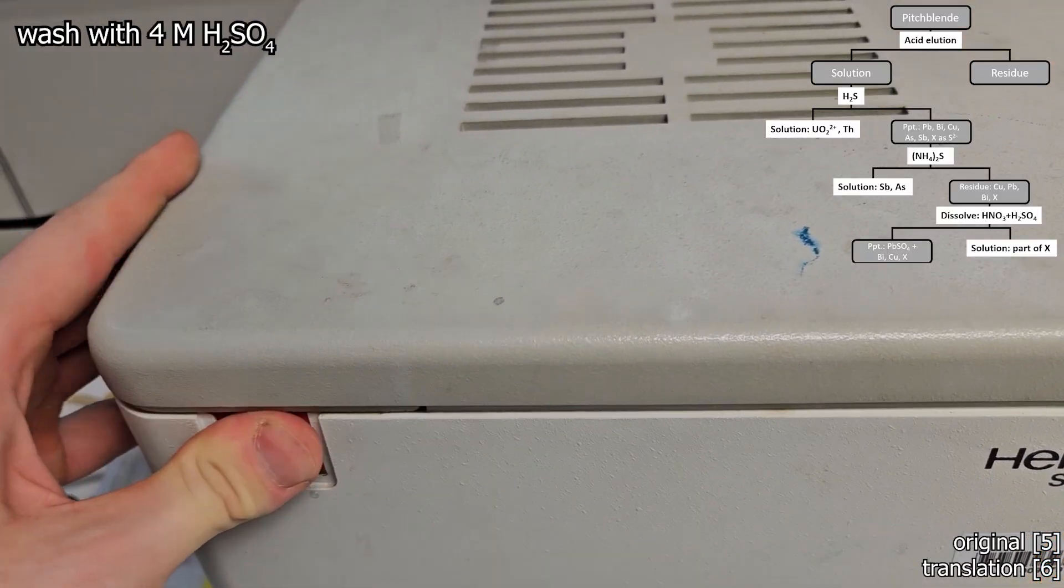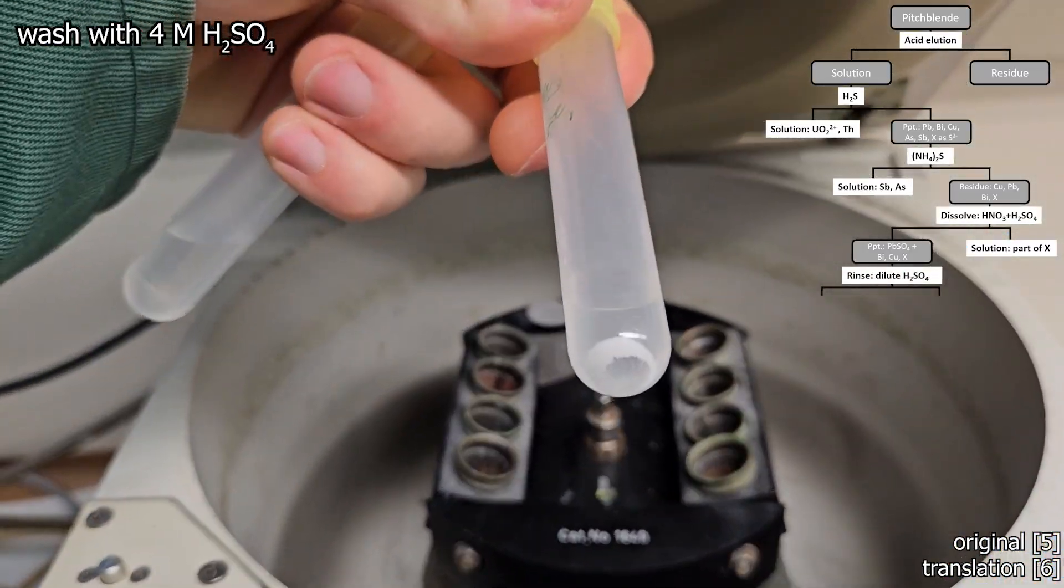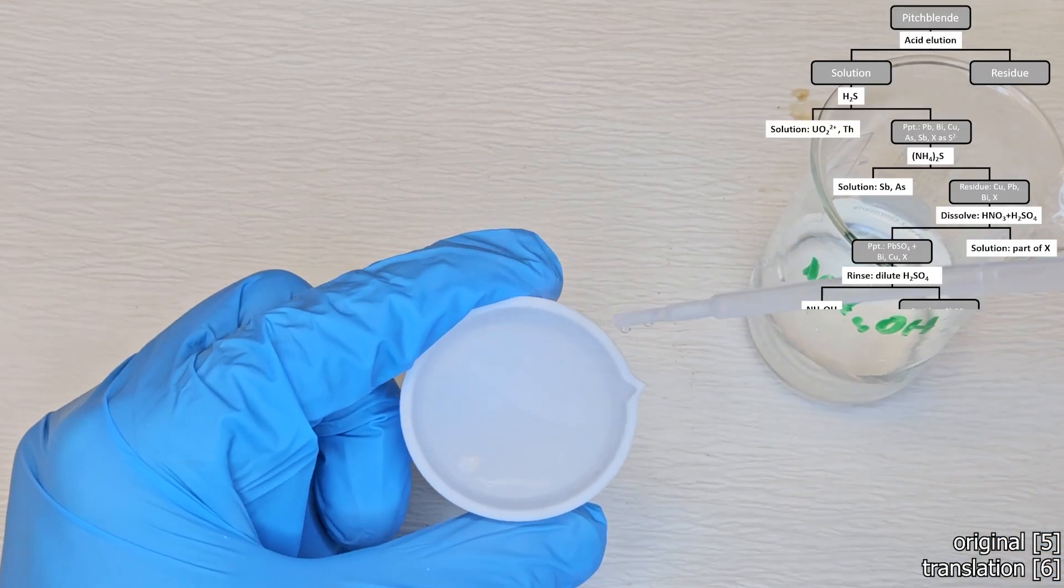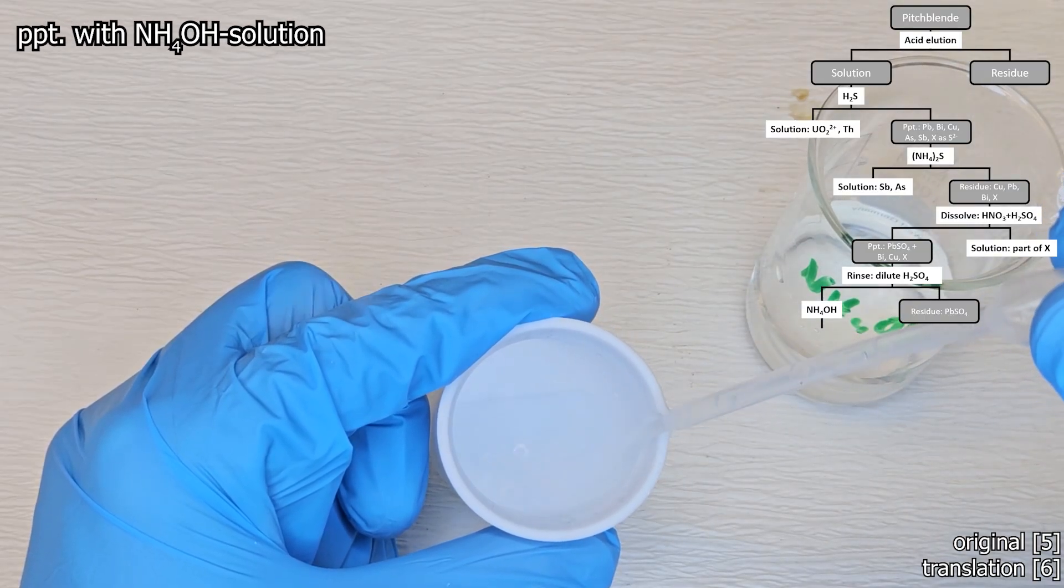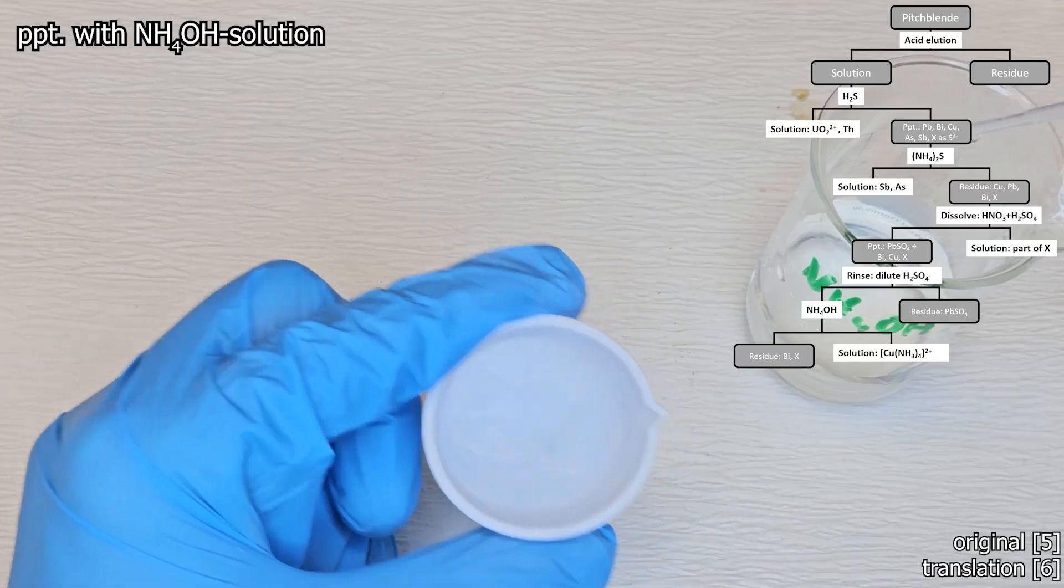After centrifuging the lead-barium-radium sulfate residue, the solution with polonium, bismuth and copper is then washed again with sulfuric acid. The sulfuric acid is then mixed with ammonia solution.